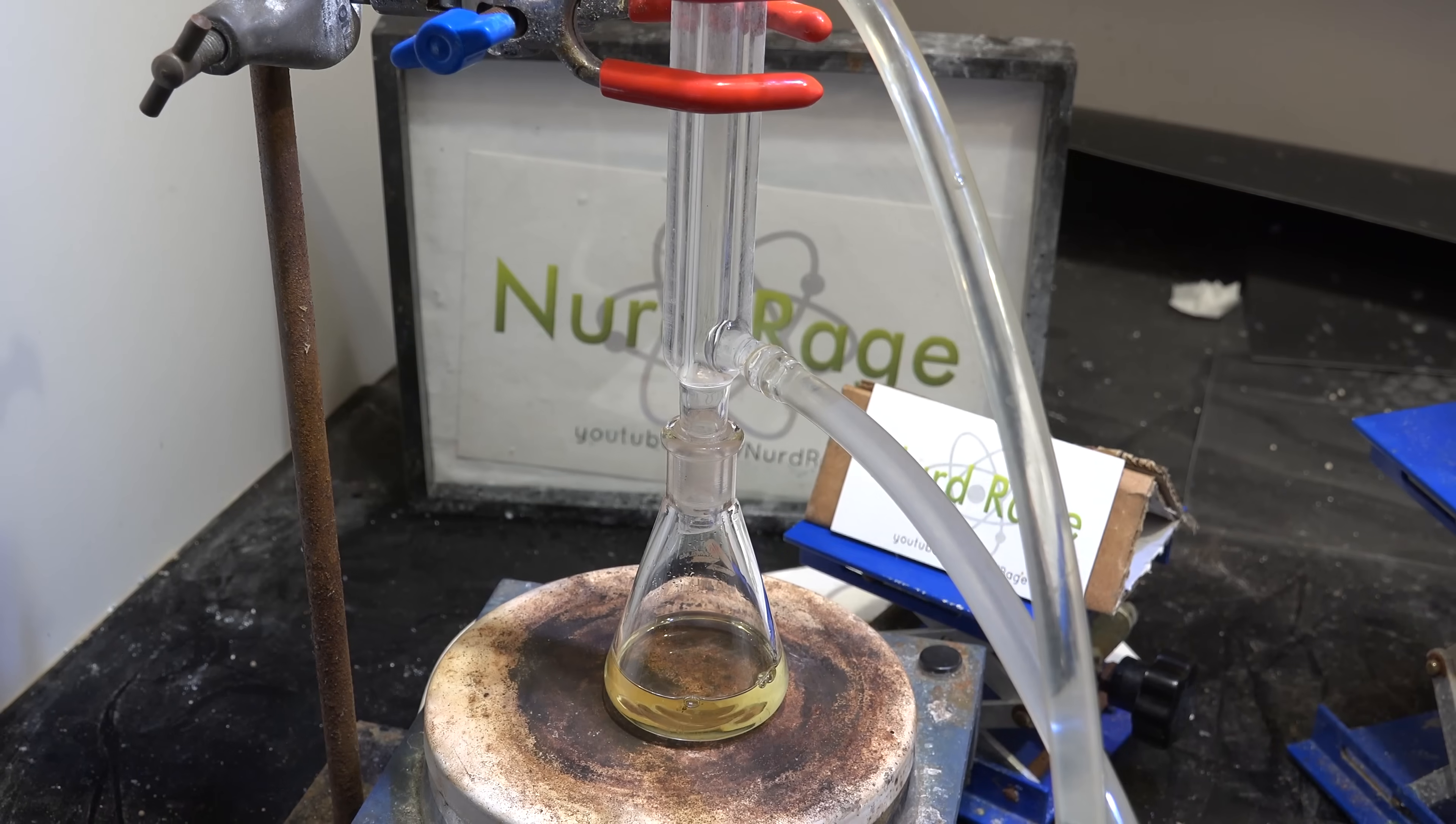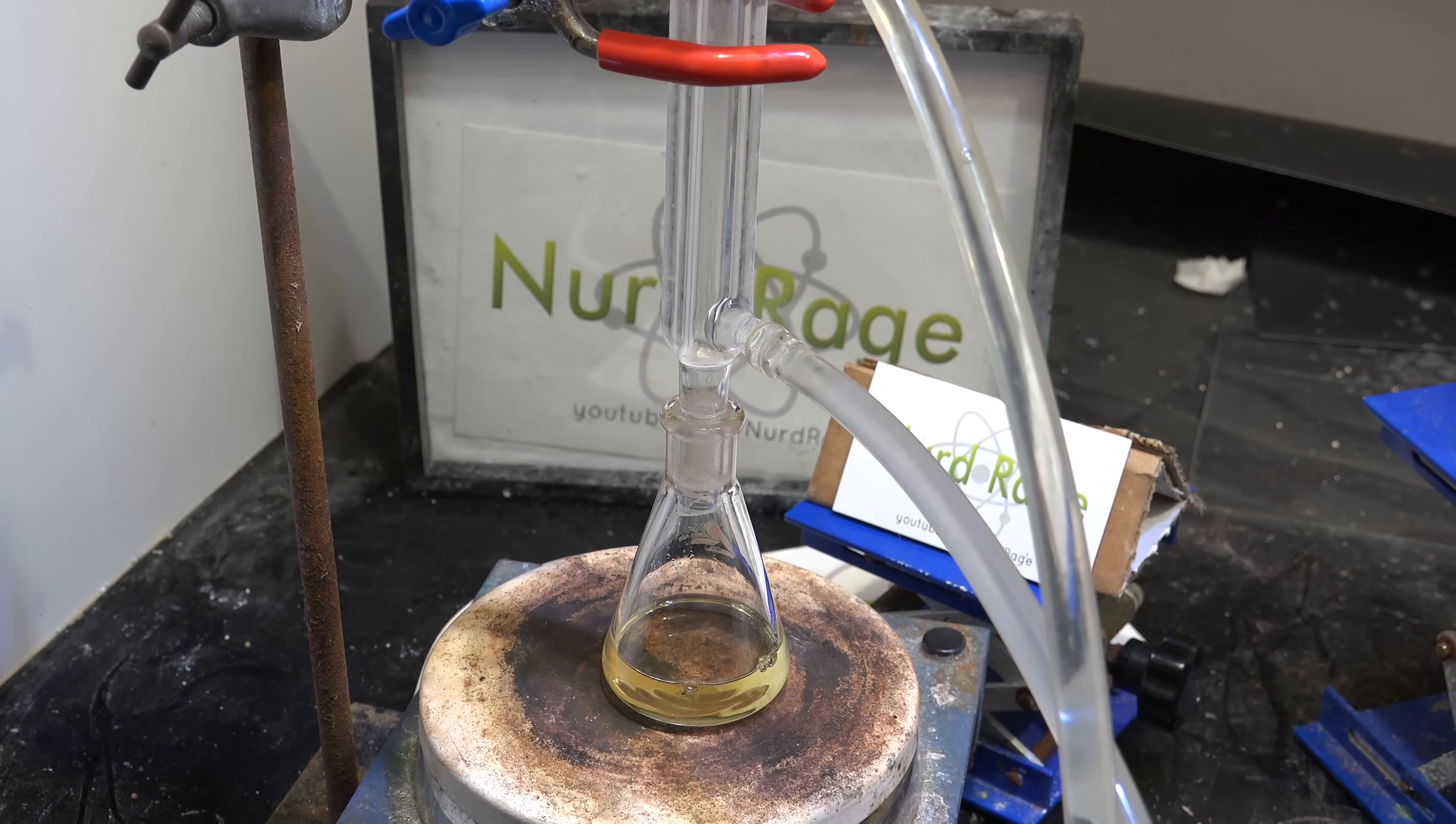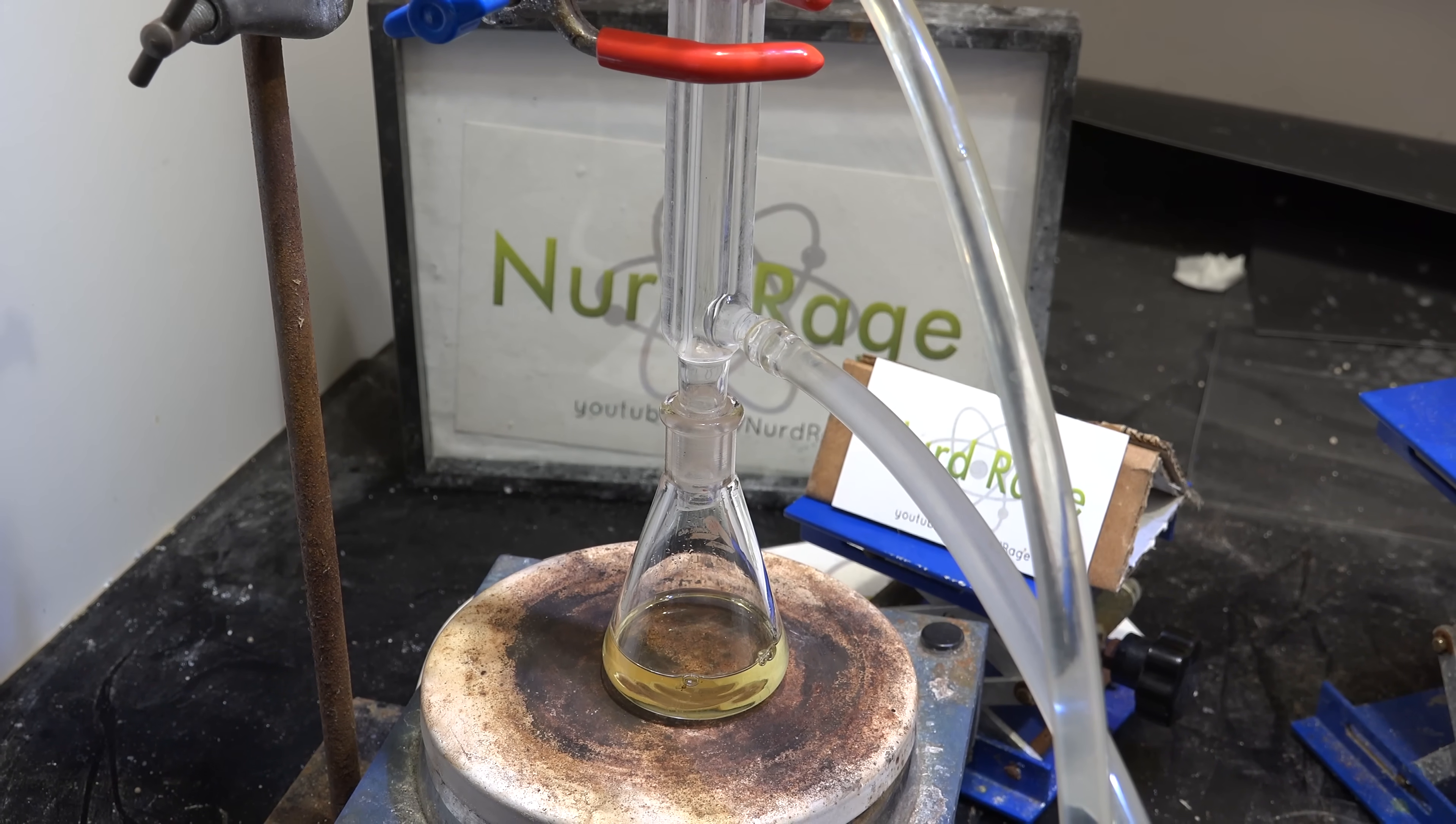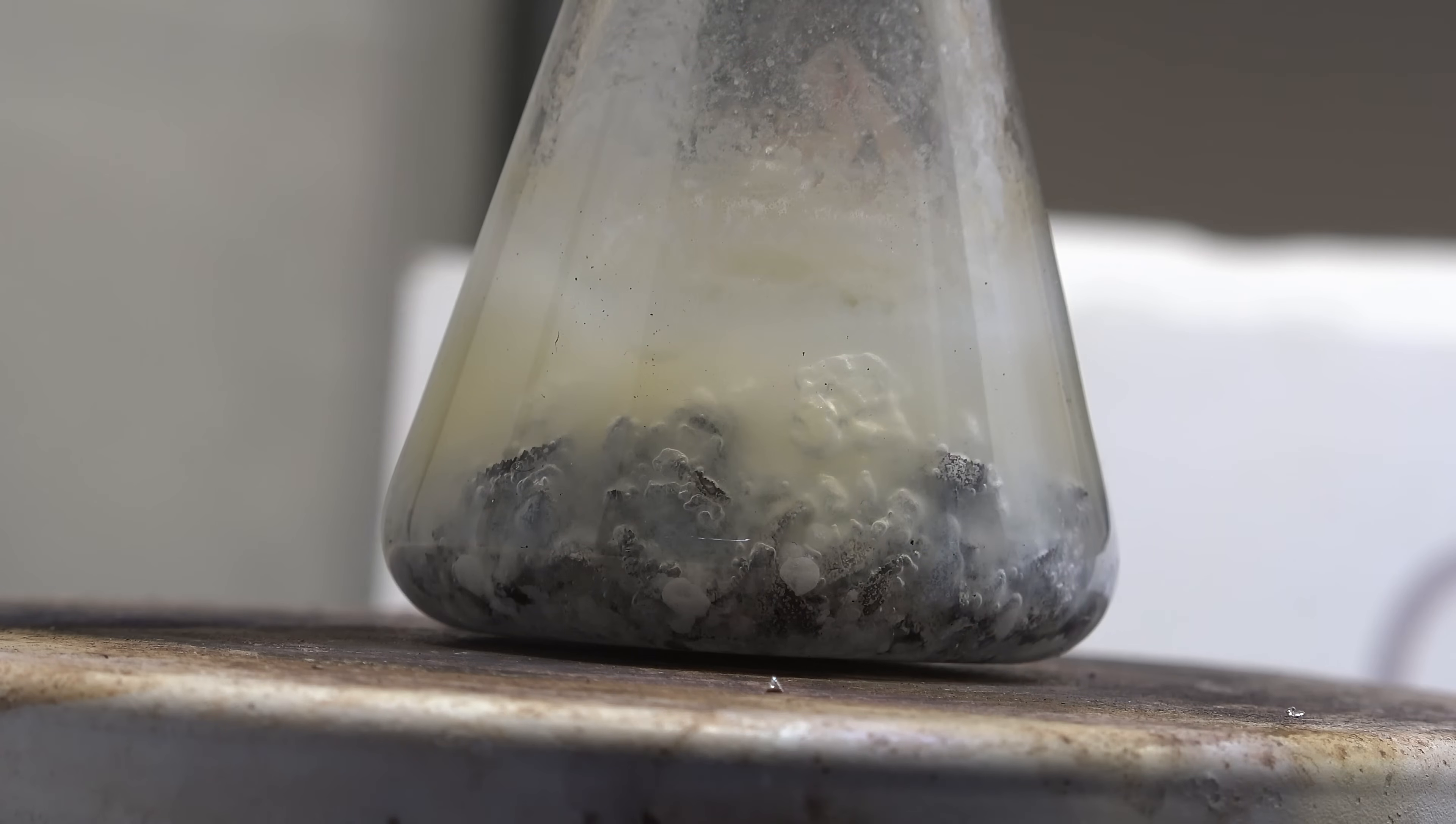The major problem is that 7-hexyl-7-tridecanol is incredibly expensive since it has to be custom made. I tried the same experiment again, this time with much cheaper 3-ethyl-3-pentanol but failed since the alkoxide solidified even at these temperatures.